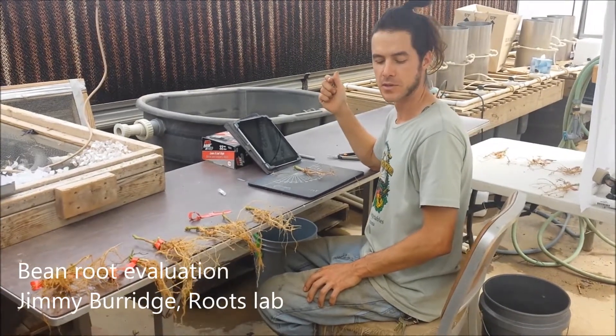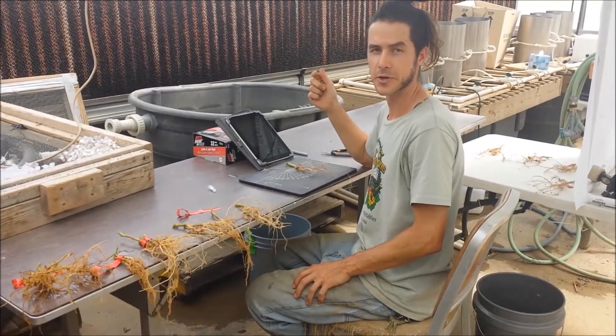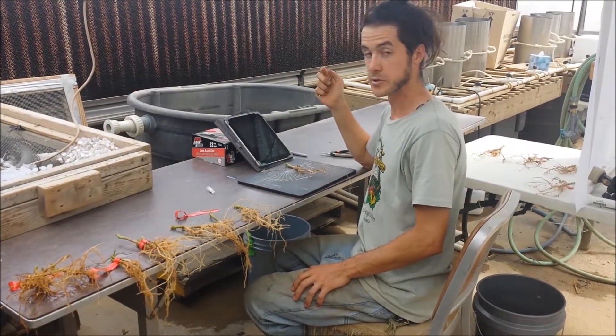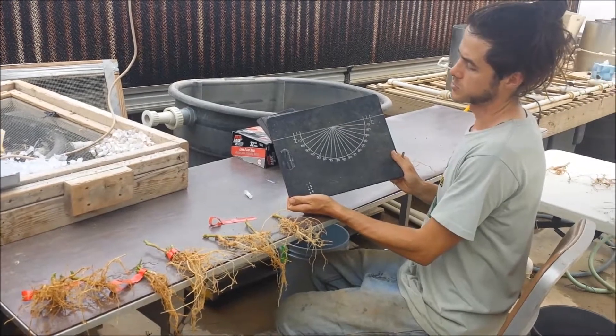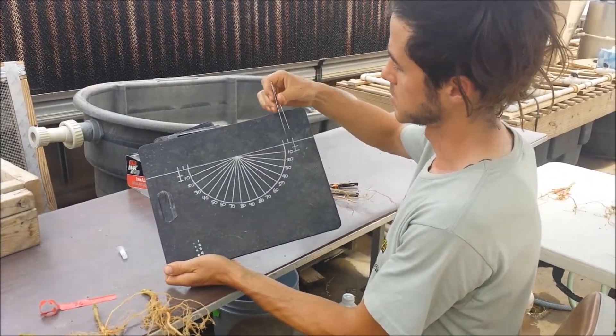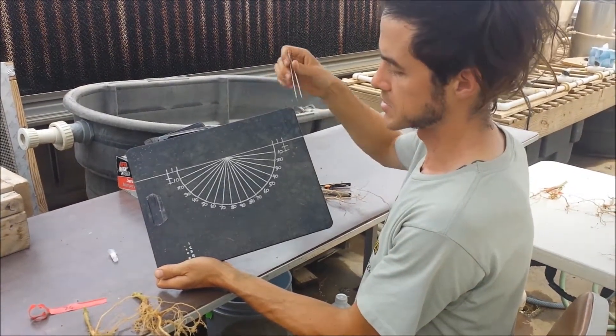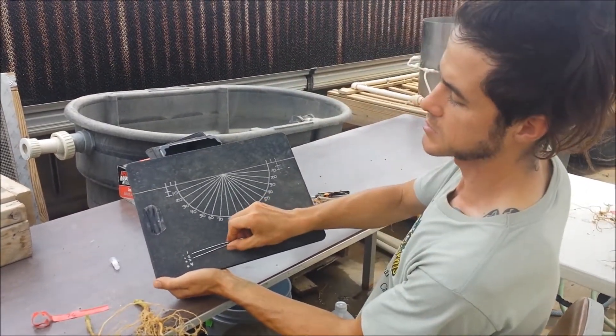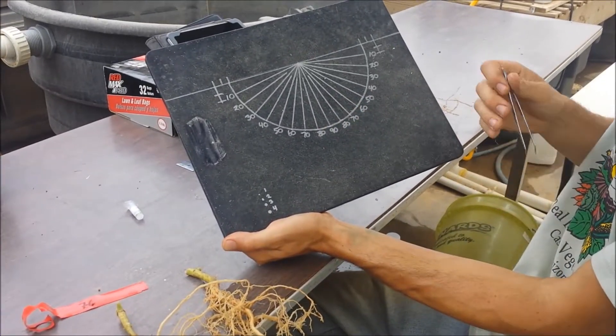Now that we have the roots in the greenhouse, we're going to evaluate them for some root architectural traits. We're going to do this using our shovel-oven scoreboard, which is basically a protractor with some two centimeter segments that helps us count density. There are also some dots reflecting diameter that we can use for nodule size.